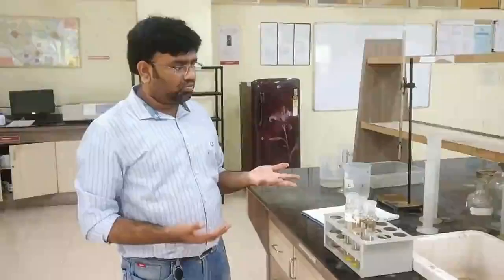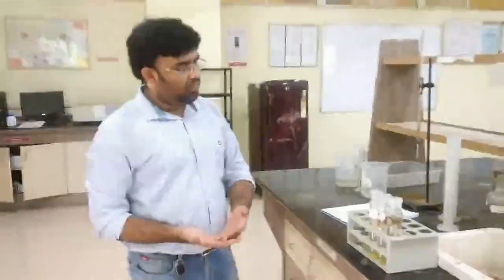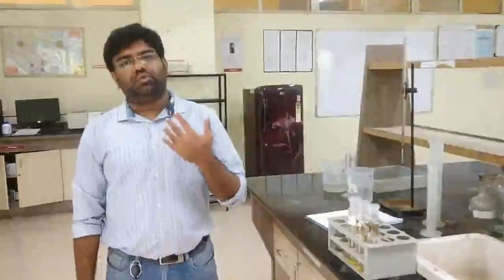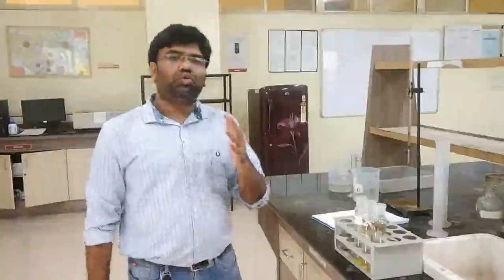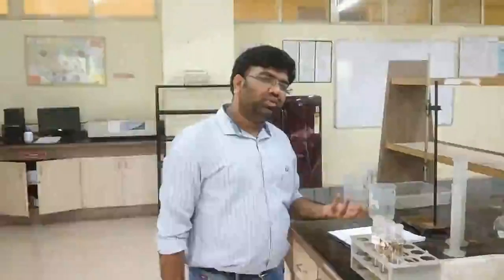But to avoid some last minute failures, for each dilution it is recommended that you keep 2 flasks. In our case, we are going to keep only one single dilution. So for one single dilution, we are going to keep these 2 flasks, and the blank flask will be acting as a reference.